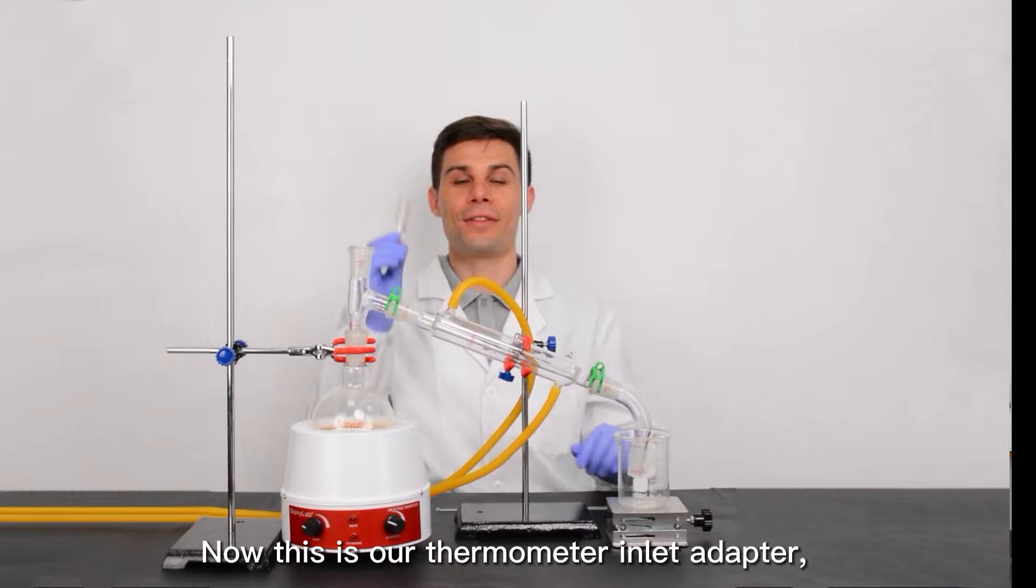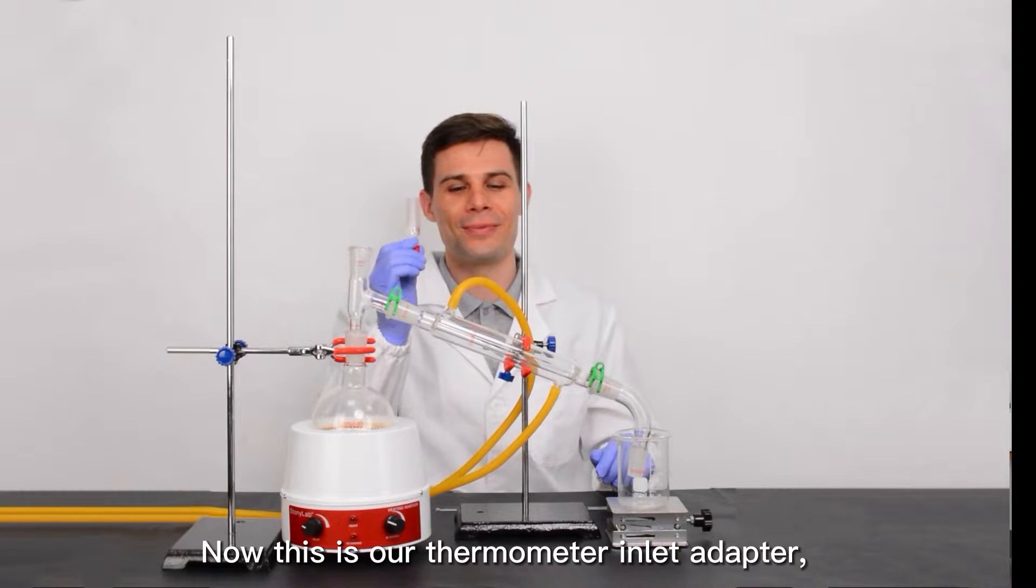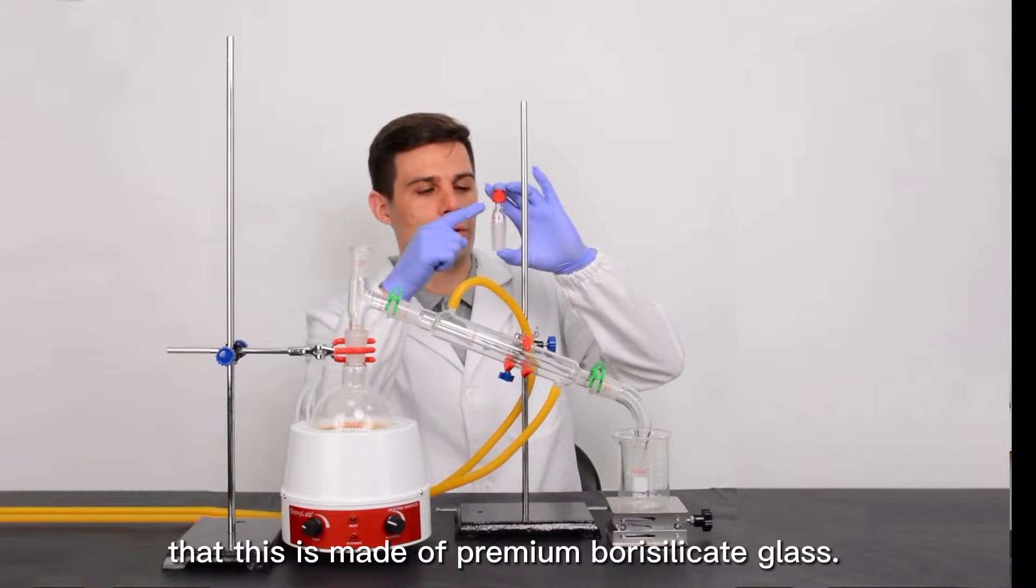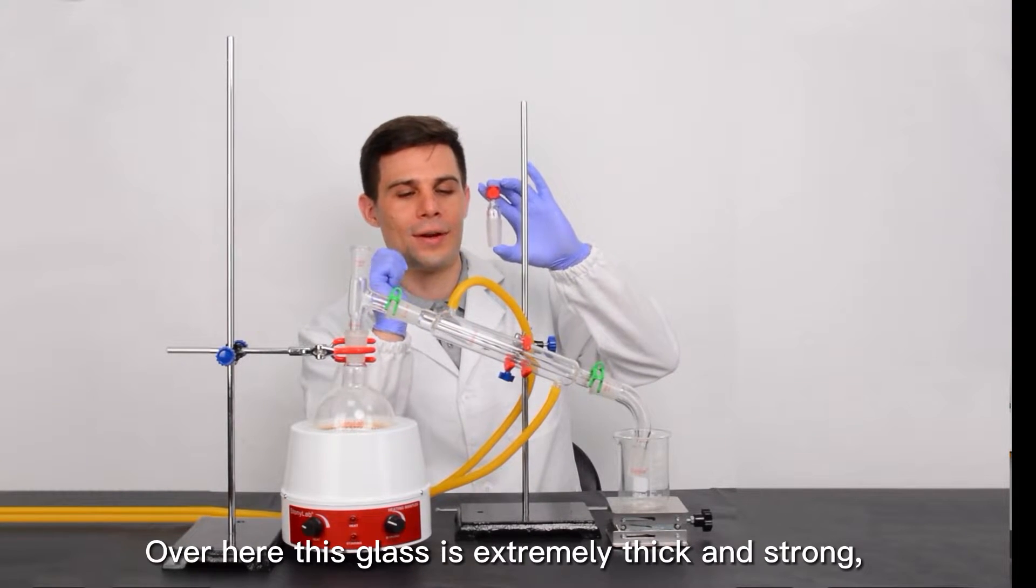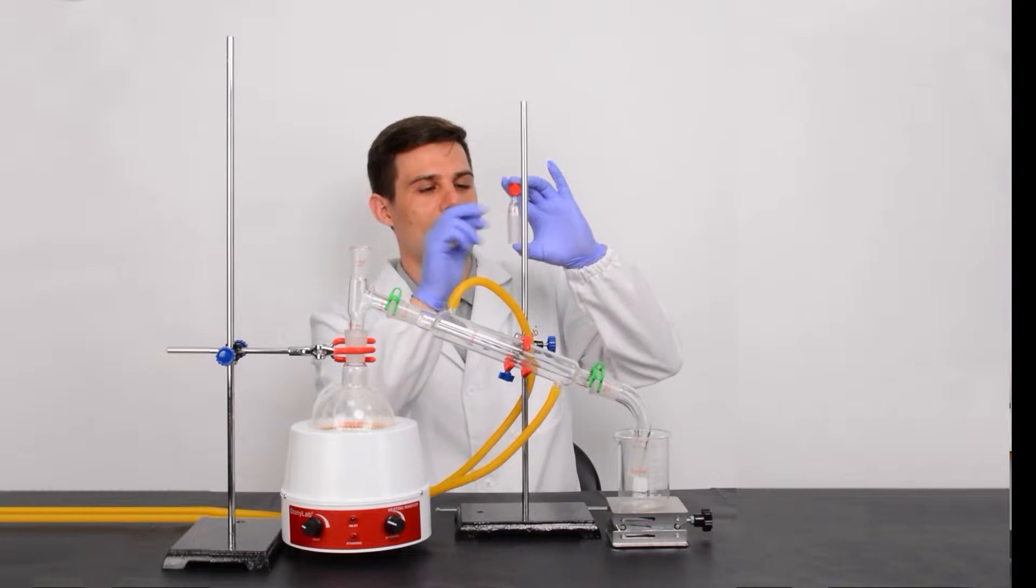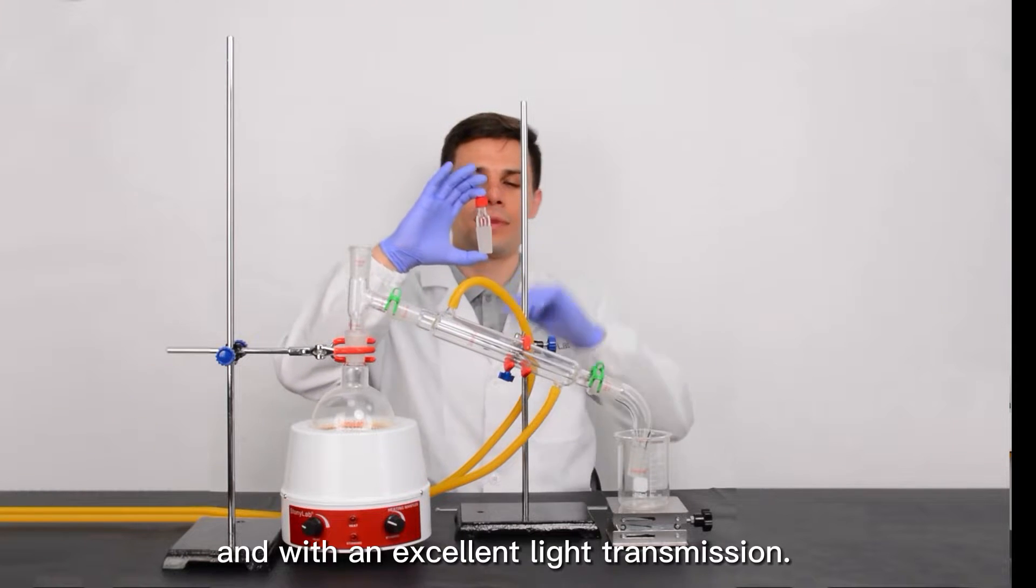Now, this is our thermometer inlet adapter. You can see that this is made of premium borosilicate glass. This glass is extremely thick and strong, and with excellent light transmission.